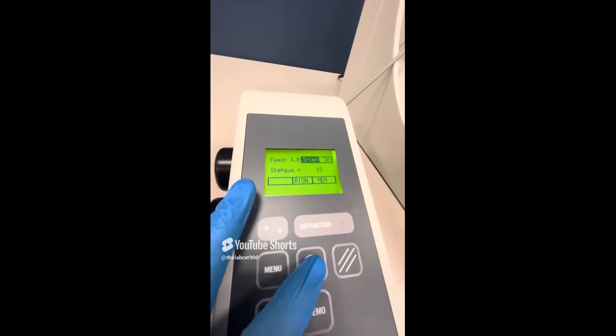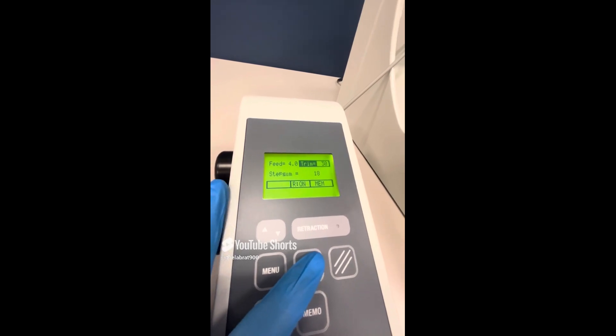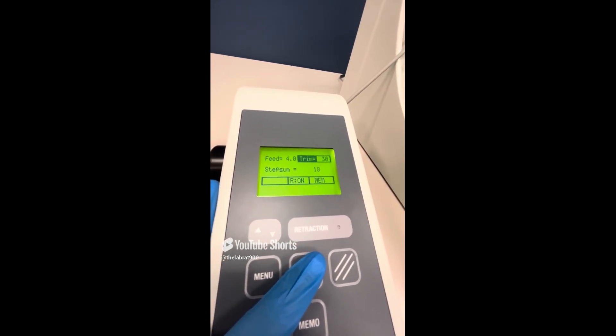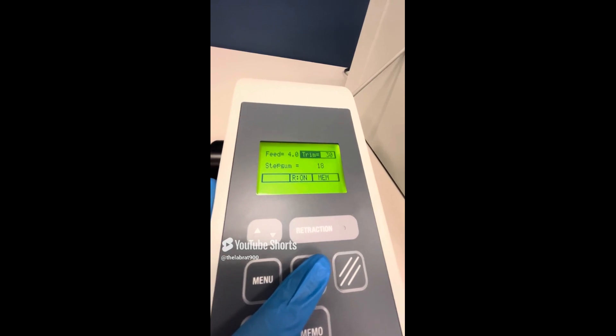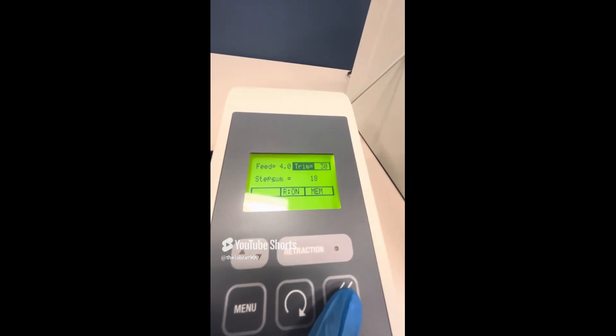Press this button again and it changes to something called step sum, which shows the sum of the sections already cut in microns — that includes the feed and the trim. It shows 18, so 18 total microns were cut within this sample. This is the reset button, so you're going to see 18 go to zero.